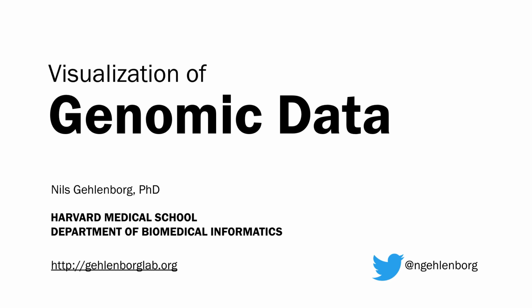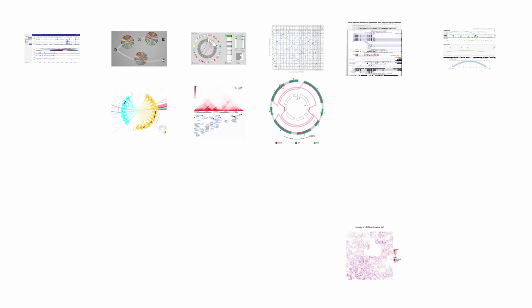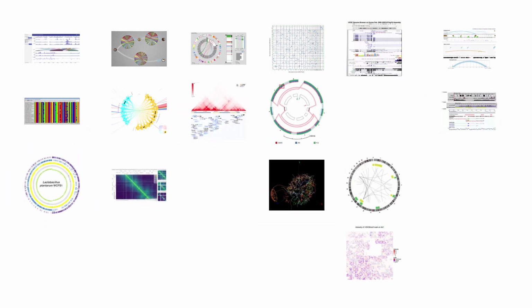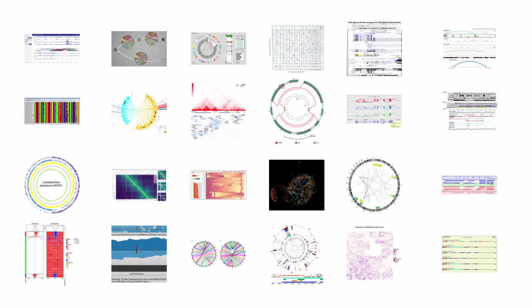All right, so visualization of genomic data. First of all, I want to show you that we have really enormous variety in genomic visualization approaches. Here are just a couple of examples of genomic data visualized in the sequence context. So this is one thing I want to emphasize.